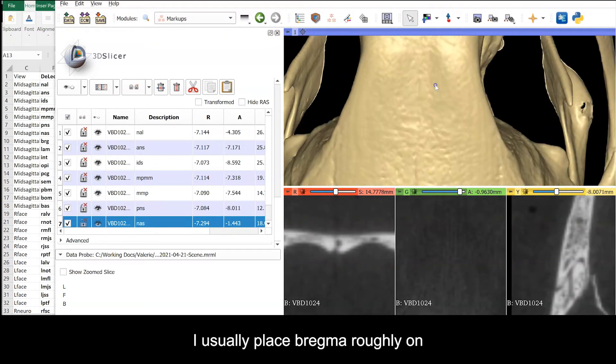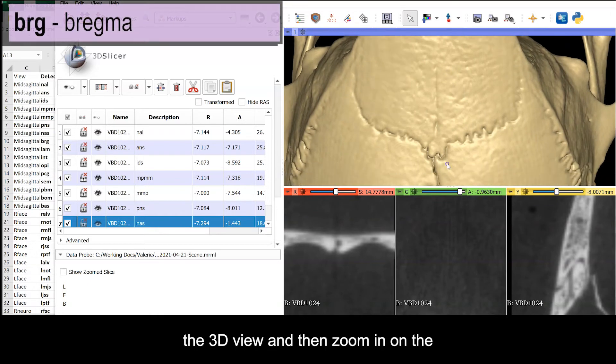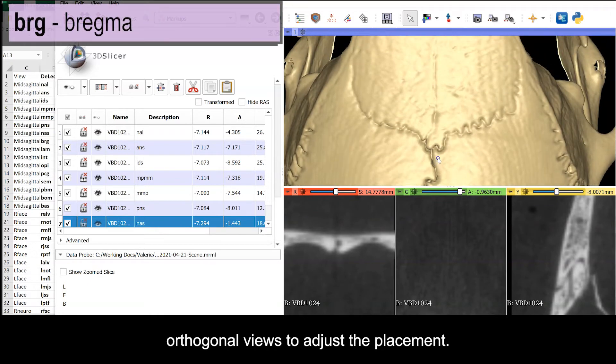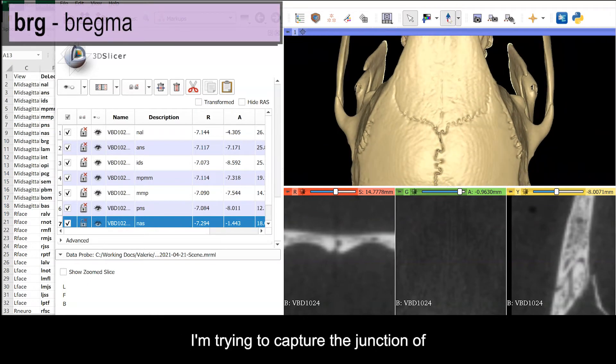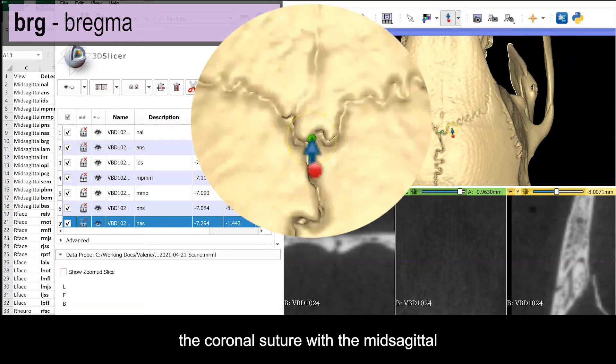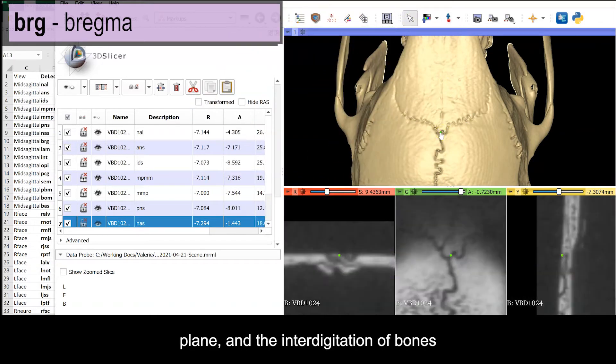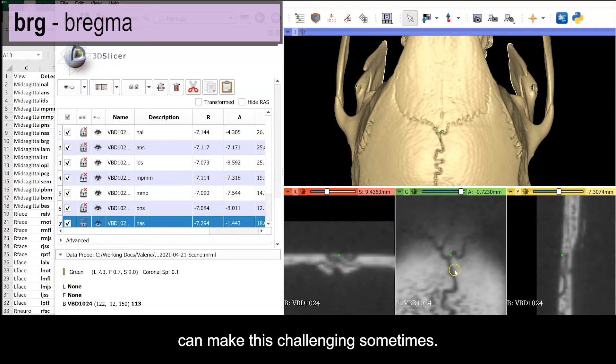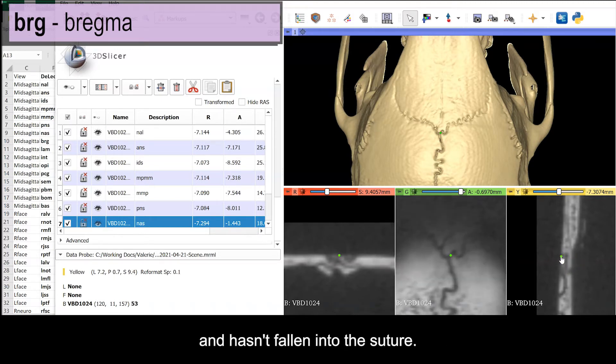I usually place bregma roughly on the 3D view and then zoom in on the orthogonal views to adjust the placement. I'm trying to capture the junction of the coronal suture with the mid-sagittal plane, and the interdigitation of bones can make this challenging sometimes, so you may need to project the landmark. Also confirm in the orthogonal views that the landmark is on the dorsal surface and hasn't fallen into the suture.